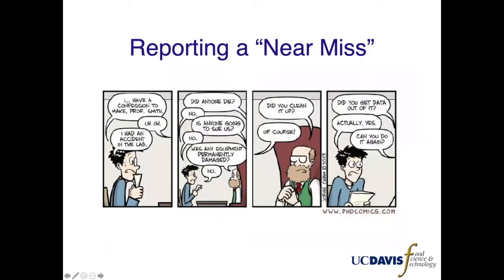So we talked about laboratory accidents, but what about near misses? These are important as well, as they can help prevent an accident from happening in the future.